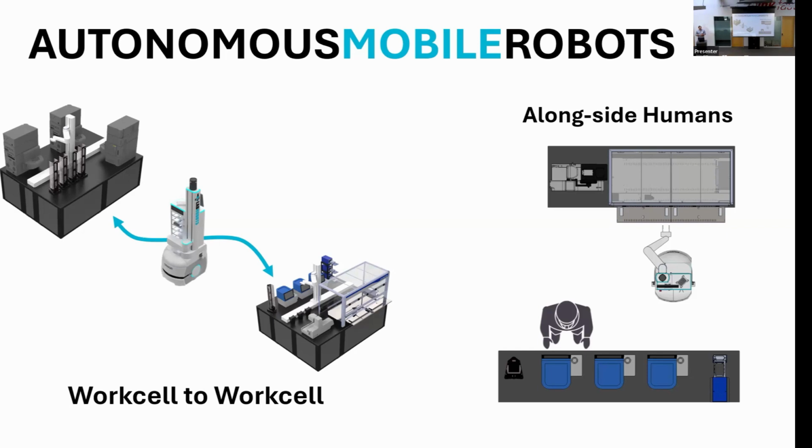To really utilize the technology, however, isn't so much in that sample transport. It's actually working directly alongside humans in an already developed lab space. That requires the robot to actually access and control instrumentation directly, but then you could simply have the robot perform the workflow that a technician might be performing in day-to-day operation.